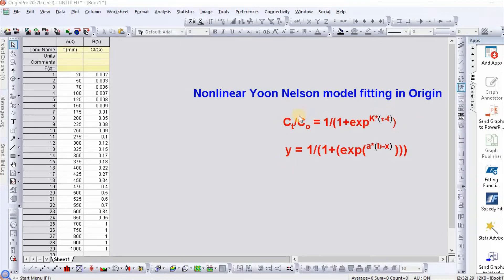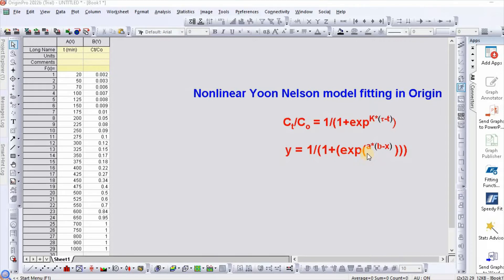Let us consider Ct/C0 equal to y, k equal to a, and τ (tau) equal to b. So our function becomes: y = 1 divided by (1 plus exponential(a * (b minus x))).